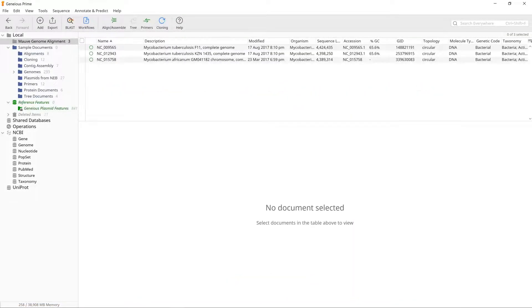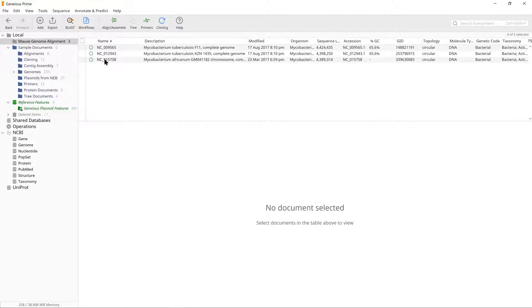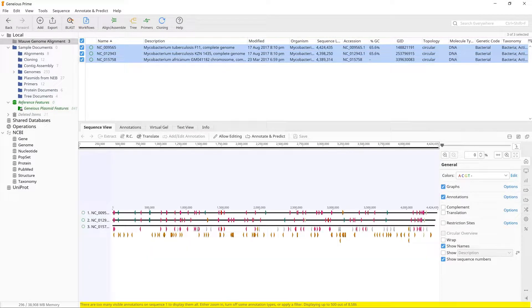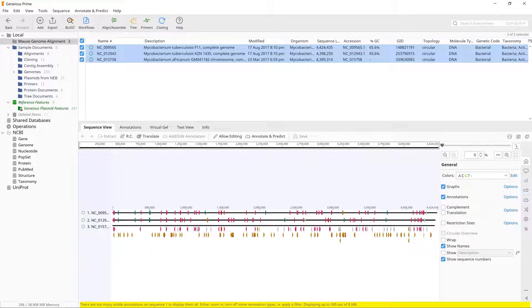In this exercise, we will create an alignment of three Mycobacterium genomes. Holding down shift, select the three sequence documents. These are complete genomes downloaded from NCBI.